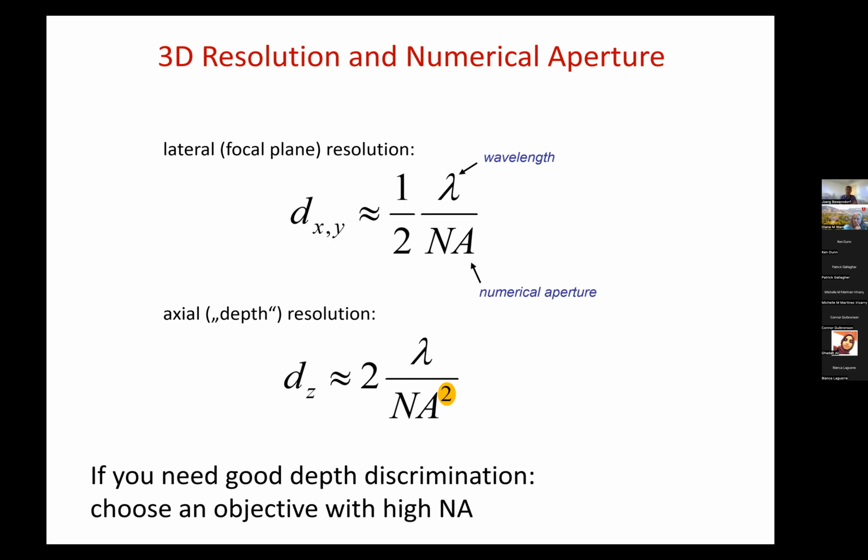One is by choice, and the other one is not by choice. Sometimes you want to do very rapid imaging. Let's say you have cultured cells on a cover slip. You just want to see how many there are, if they divide, these kind of things. In that case, you just want to take 2D images, not 3D images. And you actually have no interest in seeing only a part of the cell. You want to see the whole cell. So you don't want to filter out any light from a micron above or a micron below. So in that case, you want to see the projection of the whole cell, and going to a smaller numerical aperture allows you to do that.